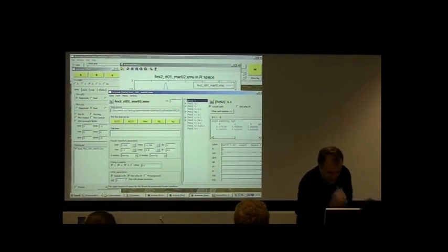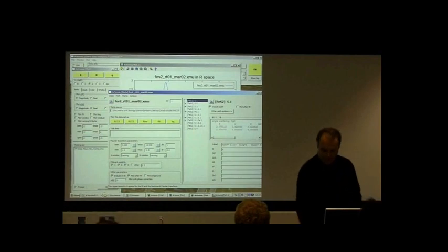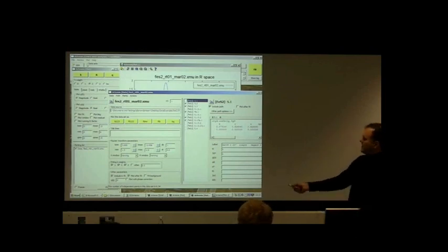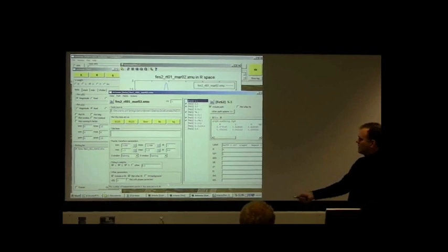If I hit the carriage return button right now, I get an interesting little snippet of information down at the bottom of the screen. It uses these values, the Fourier transform range and the fitting range, to tell me an approximation of the amount of information in the spectrum.